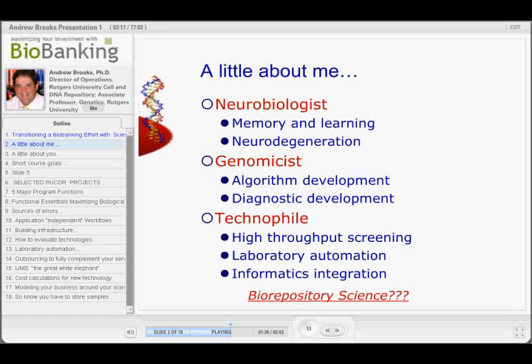And the last thing is I've always been a bit of a technophile. In order for us to accomplish work in our lab, we do a lot of high throughput screening. I remember when my lab got into automation, before we were actually doing things in the repository sciences, we learned a lot about laboratory automation and how that integrates into a lab without a very specific focus, and we're going to talk about that today actually. And then also from an informatics integration standpoint, not just metadata associated with samples, but how do you start to correlate real values and develop constants for looking at sample quality control as a function of what your downstream analyses are going to be.